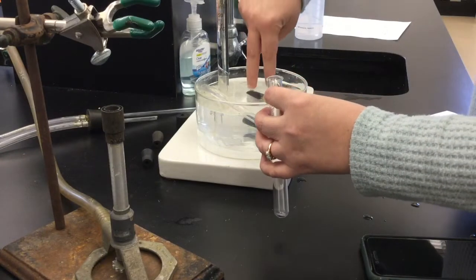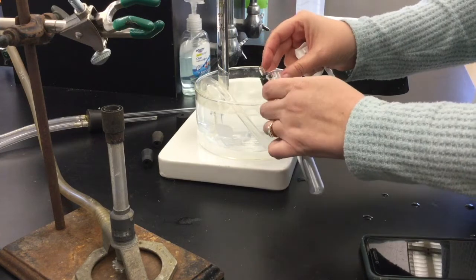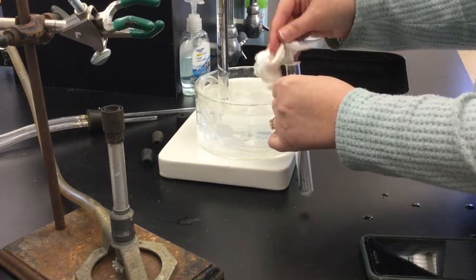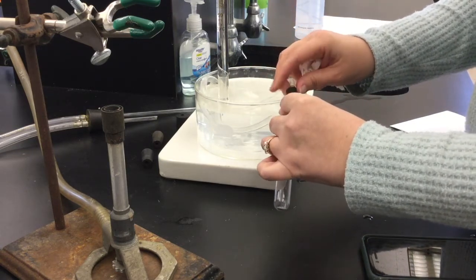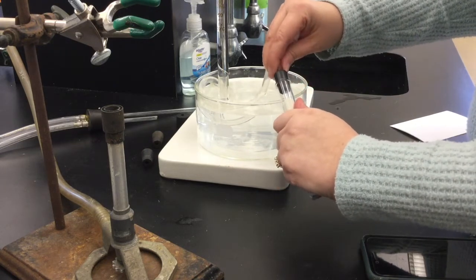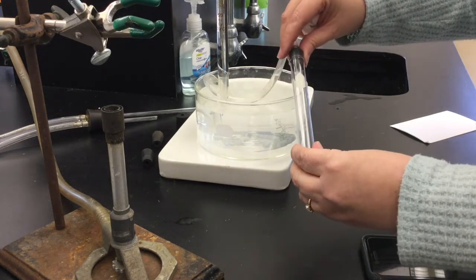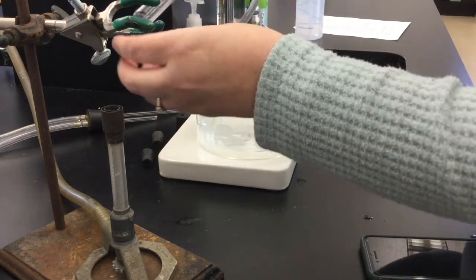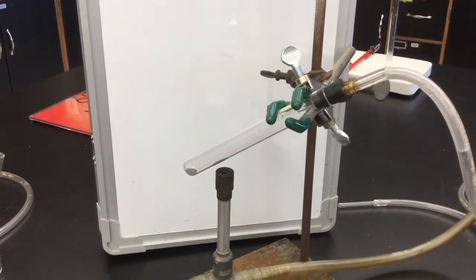Do this very close to the dish so that you take as little of the tubing out of the water as possible, meaning that you will introduce as little air as possible. Once the stopper is fairly dry, enter it into the test tube. Don't turn your test tube upside down or you'll lose your material. Secure the stopper in place, and then once that's secured, you can move your test tube over to the clamp.